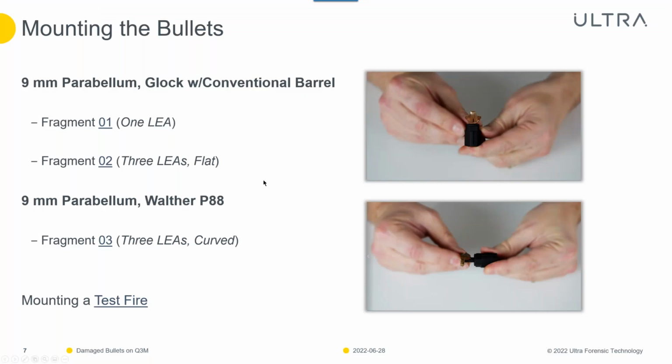So once you have a plan of attack and you know what it is you wish to achieve, you can get to that quite quickly. I think both of those videos have been 25 seconds or less in length at this stage. So it comes with experience, but overall, once you understand what it is you're trying to present to the system, how you want to present it, it becomes a pretty straightforward process to line those areas up within the wax on the stub itself.